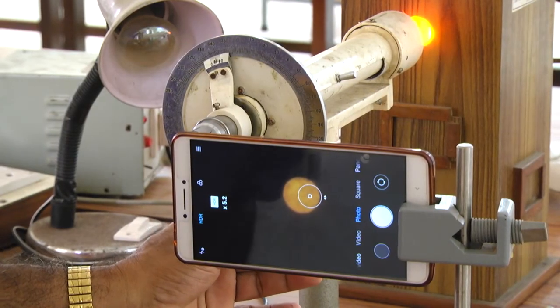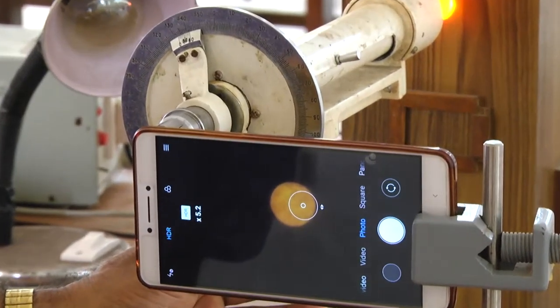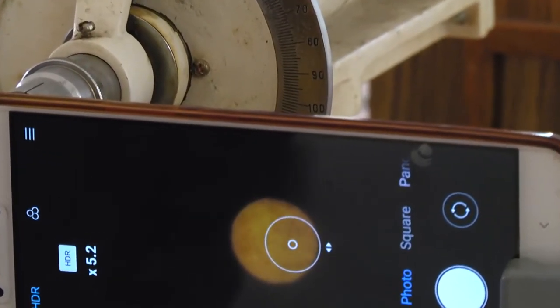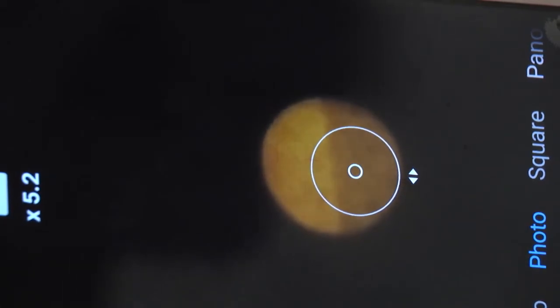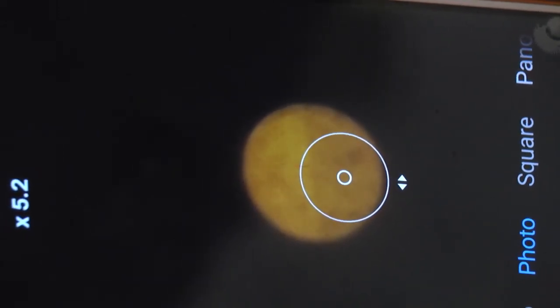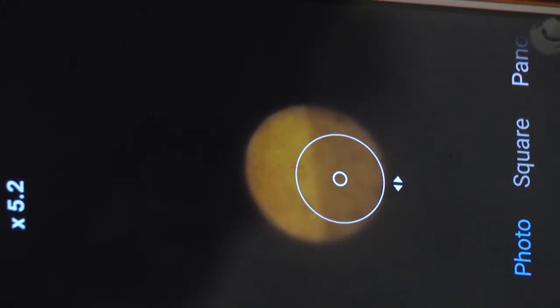So if I start from here, it's 330 degree. So it's a uniform region. If I continue the rotation, I am getting this position where you can see this half is dark and this half is bright. Then it's becoming more prominent. Let me check whether I am getting another uniform. Yes, here I am getting another uniform. If I continue, I am getting the dark on this other side and this side bright.